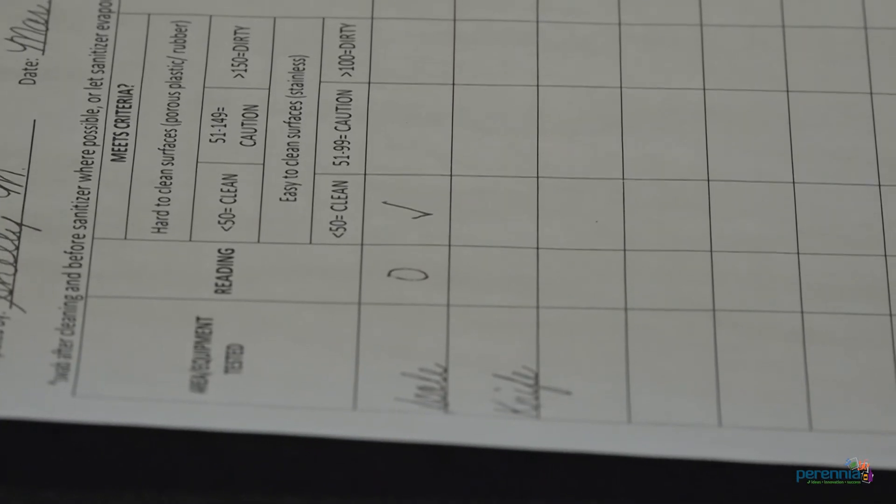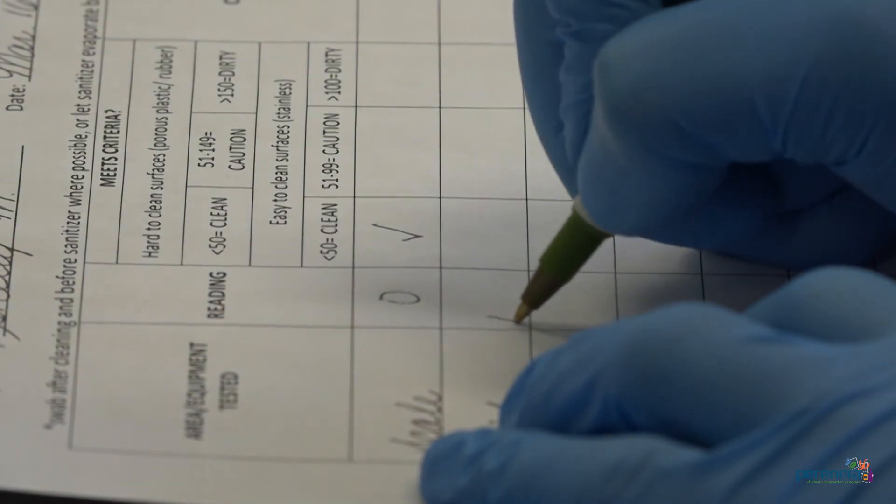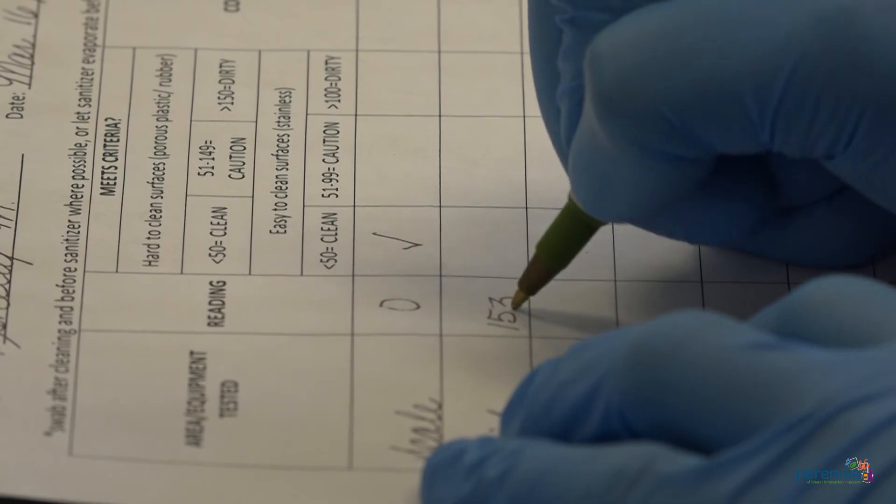Step number ten, record results on ATP monitoring records. If the records are not within spec, re-clean and re-swab.